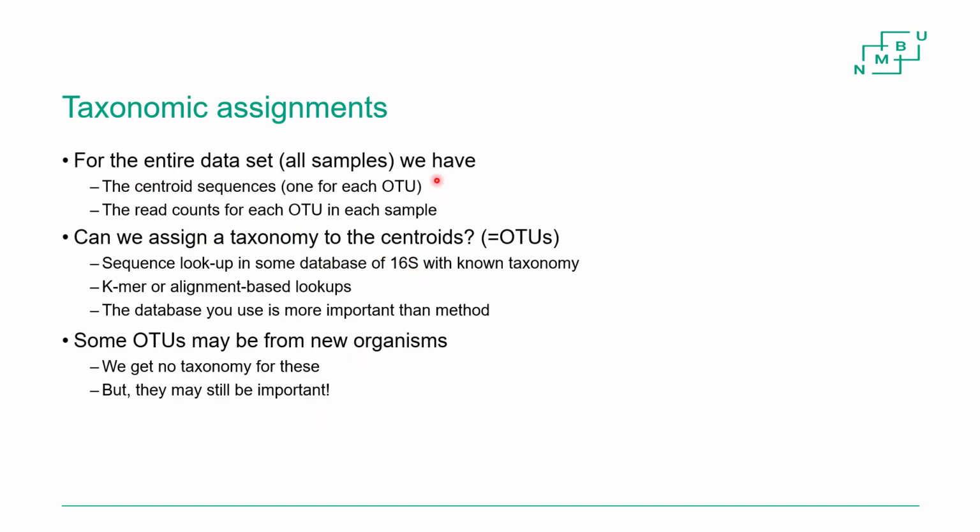The read counts and the centroids are there. We should do the analysis based on that. And that's also what we will do. But this is all for now. Go into the module 10 document and read more about the details of the things I have been talking about and do the exercises.